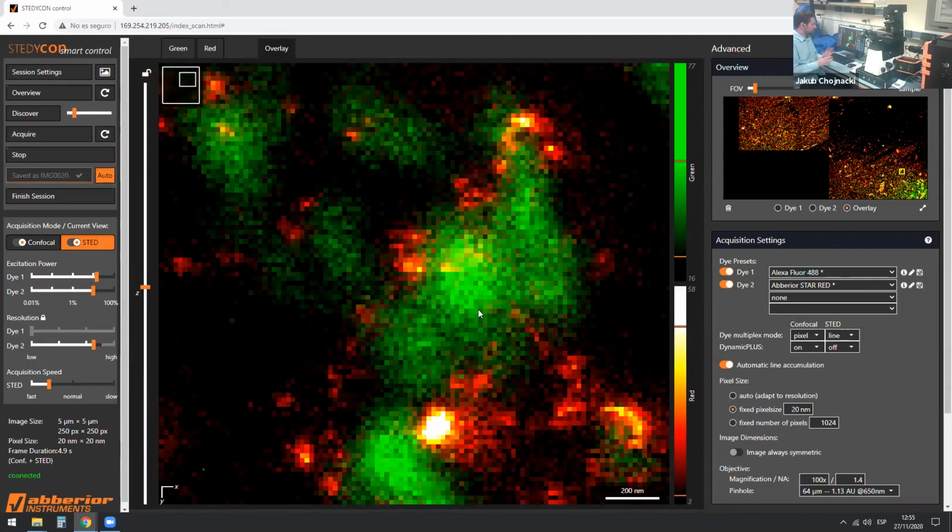So this, in a nutshell, was looking at how we image virus particles of HIV. Now, let's try the other sample. Let's try the SARS-CoV-2 virus-like particles. Let's see what we get out there.